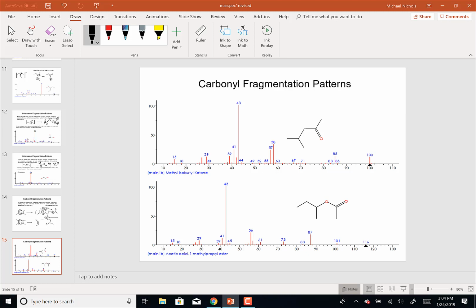So that's actually the mass spectrometry used for a lot of things. In drug testing, they have the portable mass specs that they use at the Olympics. They set up a whole mass spectrometry lab to test people. Then people use masking agents to try to cover up that peak so that it doesn't give the same mass spectrum, so that it's like, oh, it's not there. So there are masking agents and people like that for drug tests. But that's what drug testing is like.